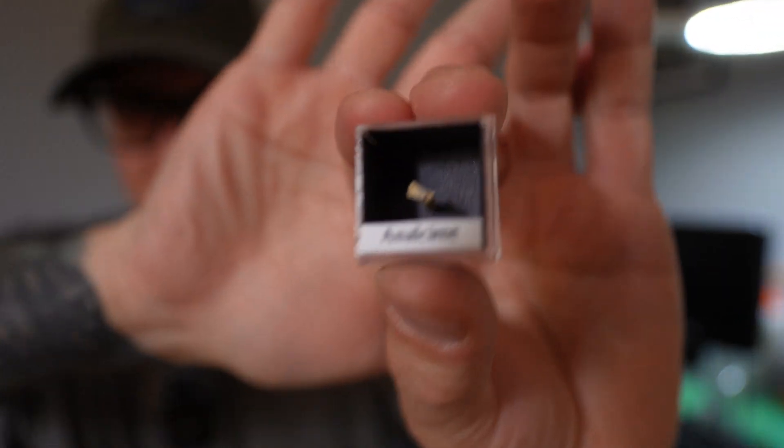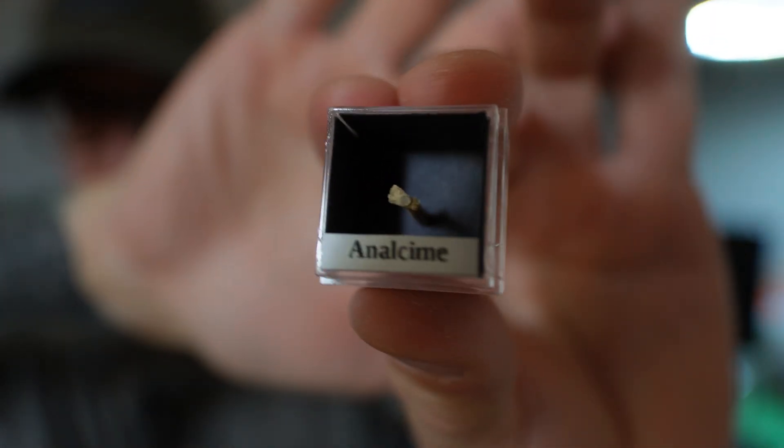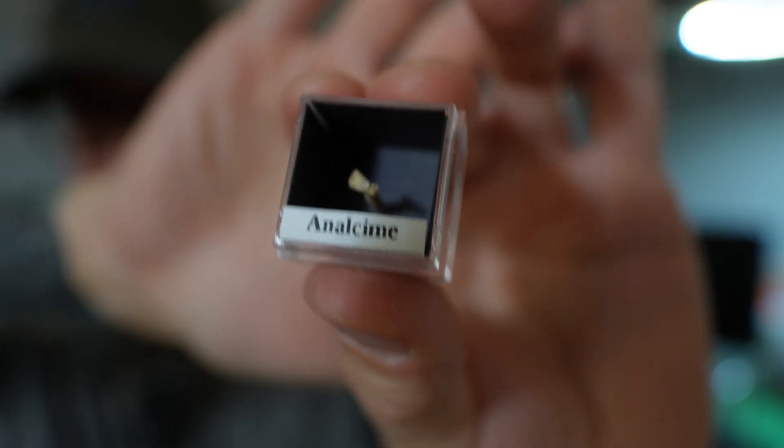To give you an idea of how small that piece of Analcime is — it is right there. That is teeny, teeny, tiny stuff. We're looking at tiny things here.